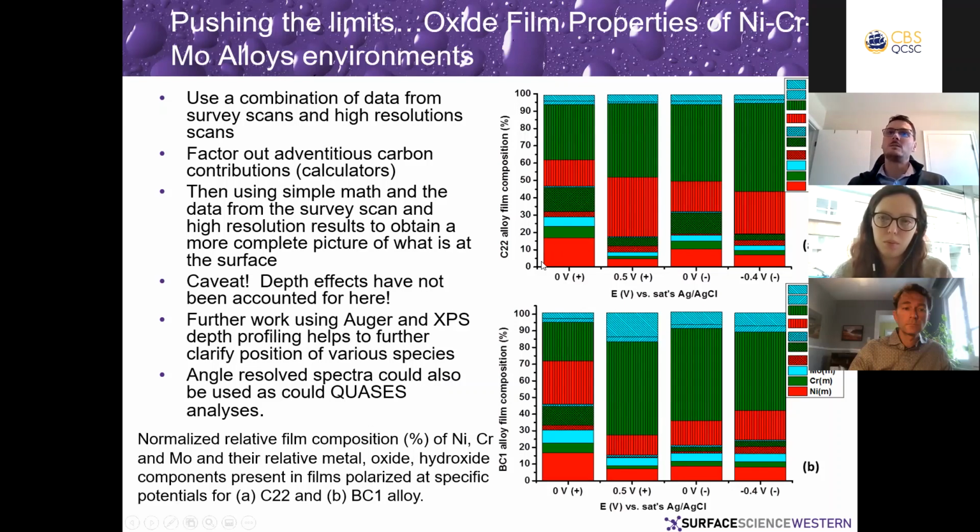So you have your nice metals down below, that's your bulk alloy. Next to the metal are more of your oxides. So we have our nickel oxide and chromium oxides right up against that surface. But then the outer layers, which have been exposed to air and water and whatever else is going on, are where your hydroxides are. So there's some layering to these structures as well. And you can figure that out from things like ToF-SIMS or angle resolved work. We've done some Auger depth profiling, etc.